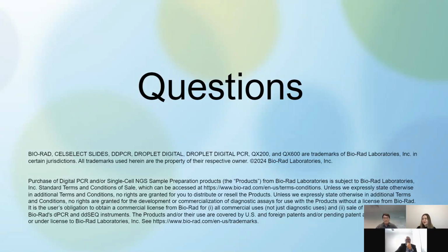This next one is coming back to you, Dr. Bodunrin, and this one asks, can you discuss more about the mutation detection capabilities of the QX200 instrument and how it compares to the QX600? Okay, thank you so much, Kayla, for that question.